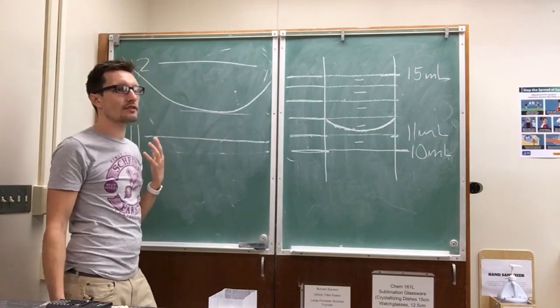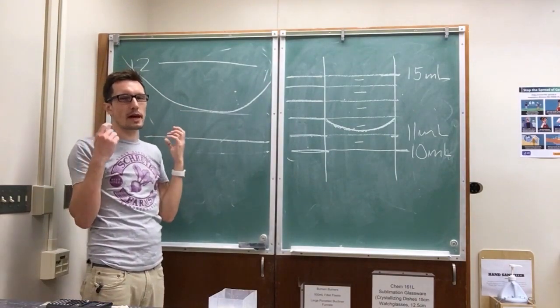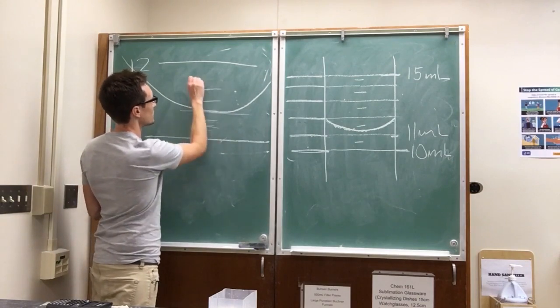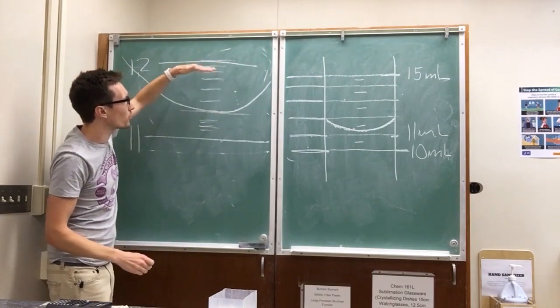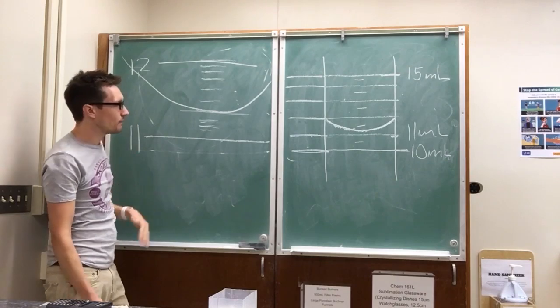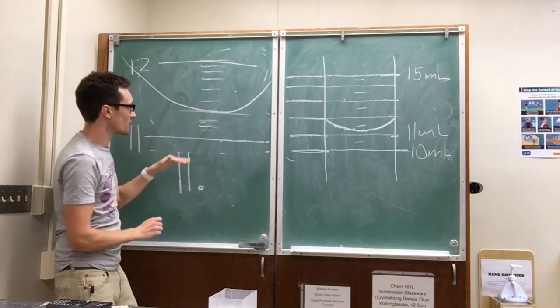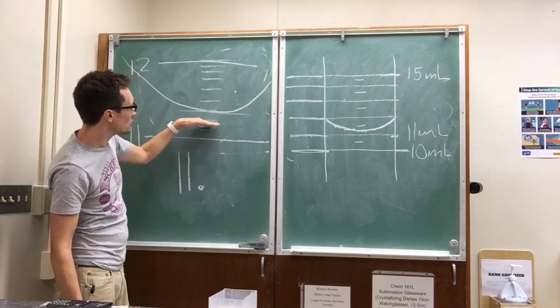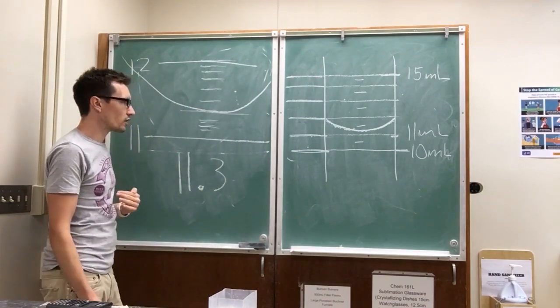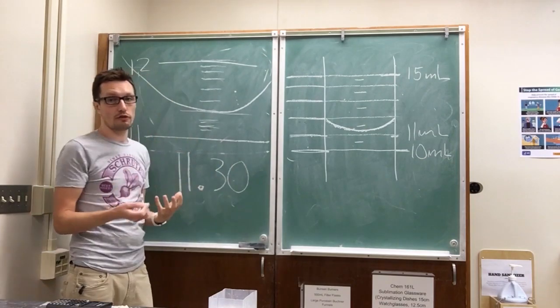The way to do this, with any kind of glassware or labware where you have two markings, is you're supposed to use your imagination and imagine 1, 2, 3, 4, 5, 6, 7, 8, 9, 10. You're supposed to partition it into 10 imaginary subunits. And then eyeball, well, okay, that is 11, I know it's 11 milliliters. 1, 2, 3, 11.3, right? Or you might even see in the lab book, they gave an example where we had an extra decimal.